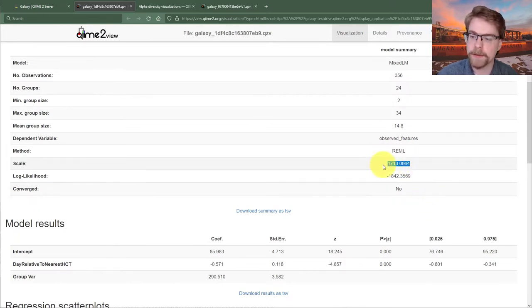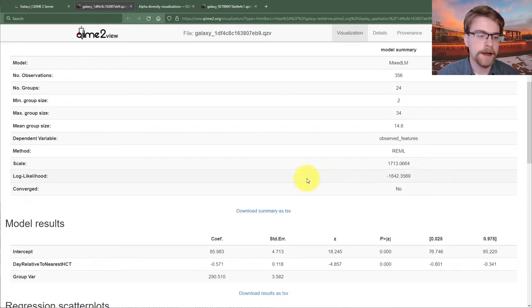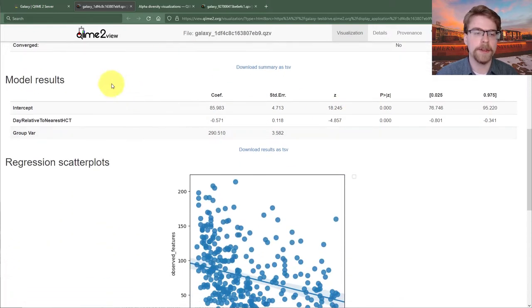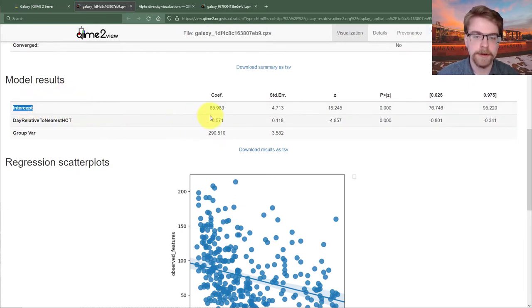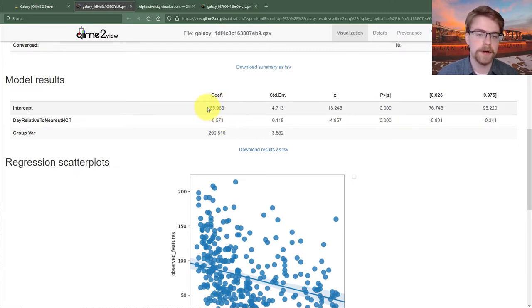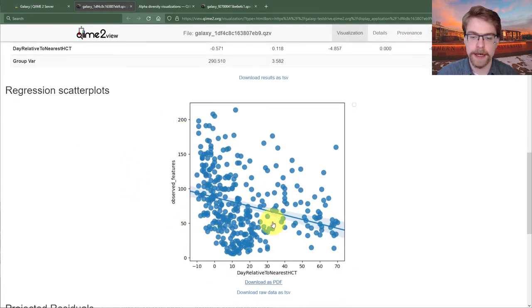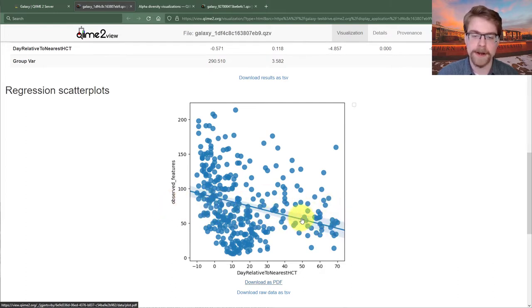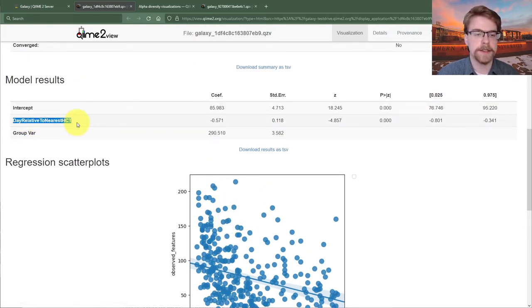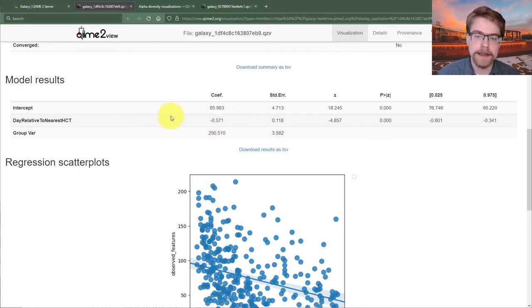We see our scale parameter — variance — log likelihood, and a note that the model didn't necessarily converge, which isn't too surprising. Looking at our model results, we see our actual coefficients. The intercept has a coefficient in natural units of richness. The average richness is generally 85 — looking at the scatter plot, that seems sensible. For day relative to nearest HCT, we're saying we subtract roughly half a unit of richness for each additional day.